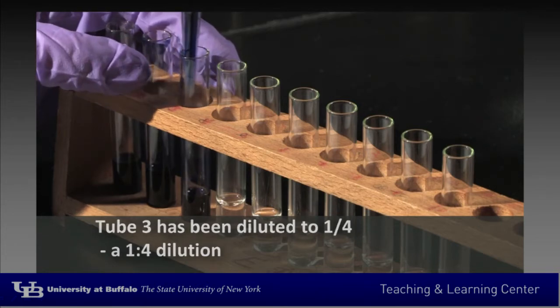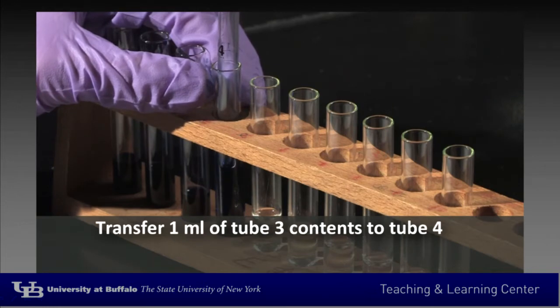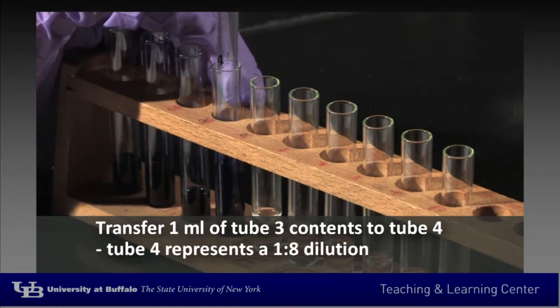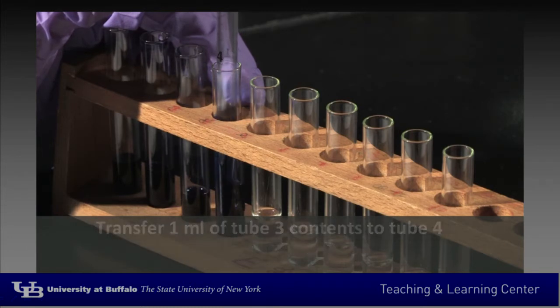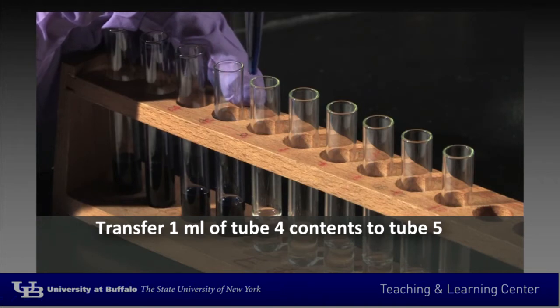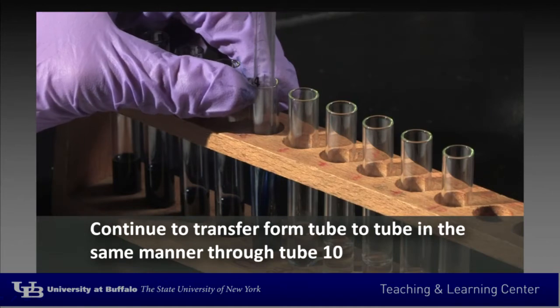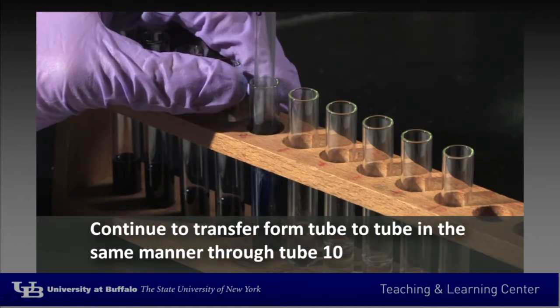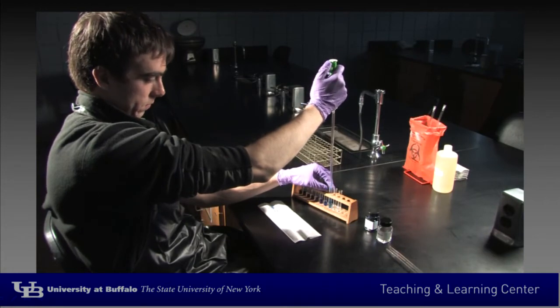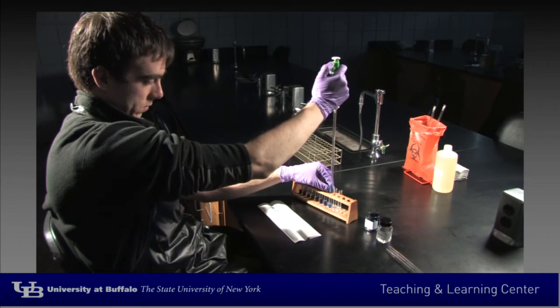With the same pipette, transfer 1 ml of the well-mixed contents from tube 3 to tube 4, which then represents a 1:8 dilution. Continue to transfer 1 ml from tube 4 to tube 5, from tube 5 to 6, etc., to the last tube 10. Again, mix the contents of tube 10 well and discard 1 ml from that tube. Each tube contains 1 ml total volume.